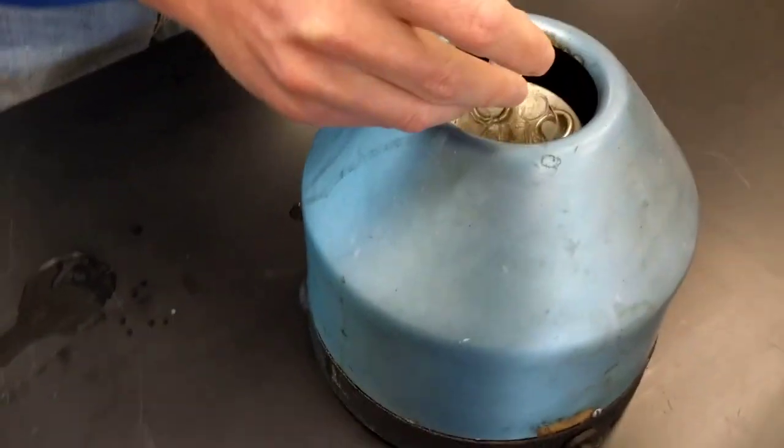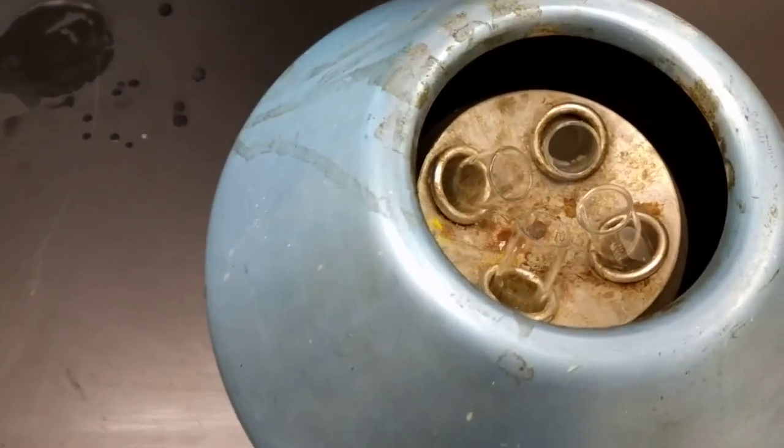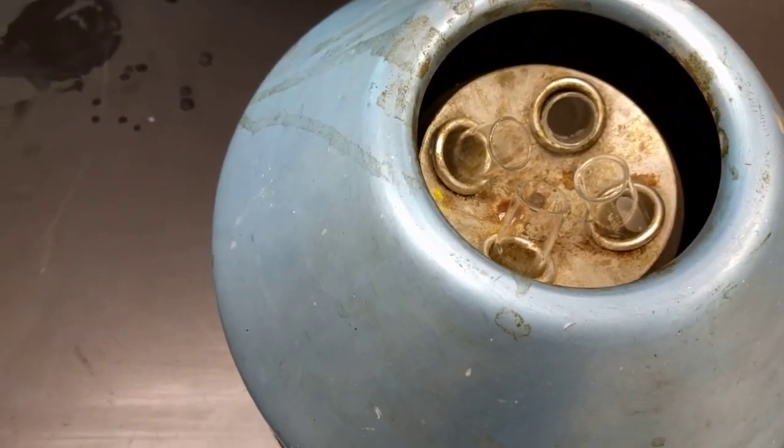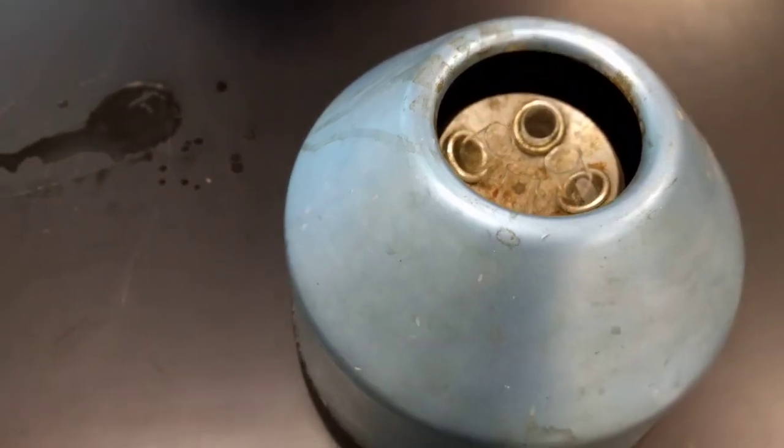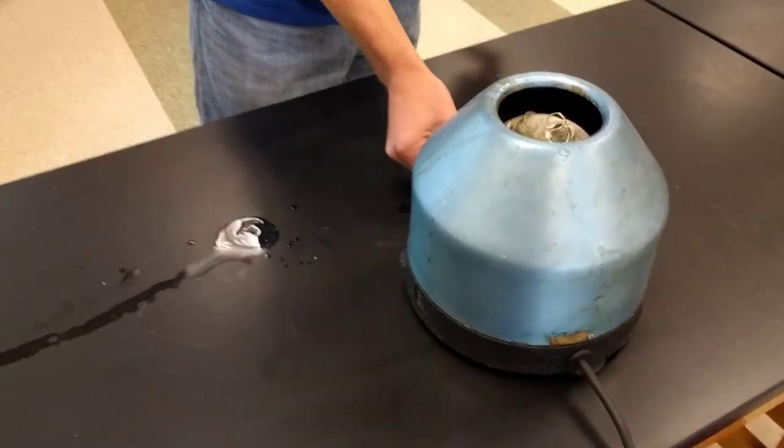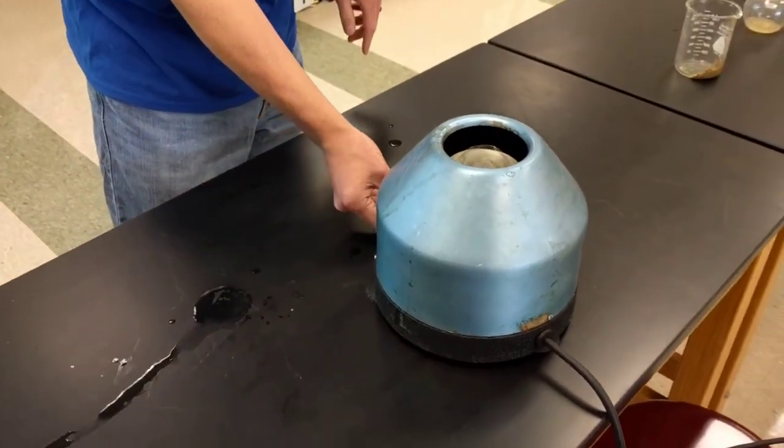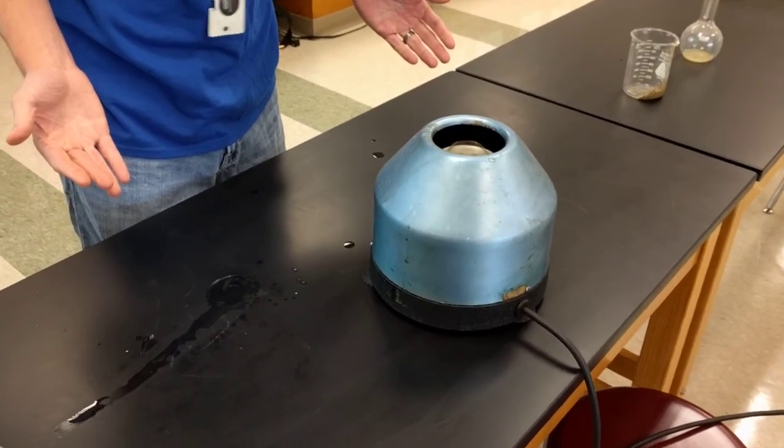As you can see in the top of the centrifuge here, we have four vials. Each of them are filled with a liquid. This is the one we're going to be looking at. The centrifuge is going to be spinning at about 3,000 RPMs.